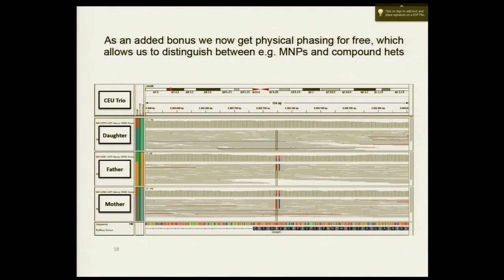What is the maximum number of variants within certain regions? Let's see. So there isn't a fundamental limit. What it does is it uses a likelihood ratio test for whether the variants happen together on haplotypes or whether they're seen on different haplotypes. And if they're always seen together, then it would combine them together into a multinucleotide polymorphism. So it's like an LD-based calculation that uses population information.